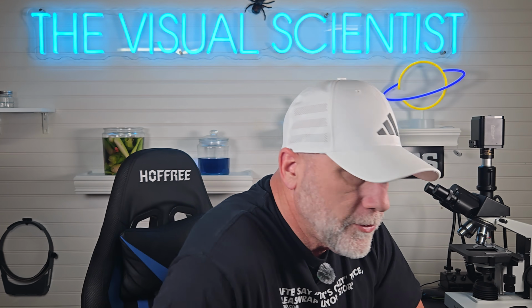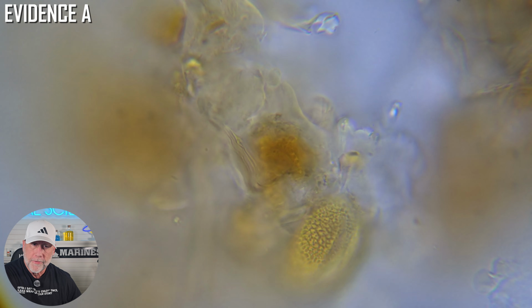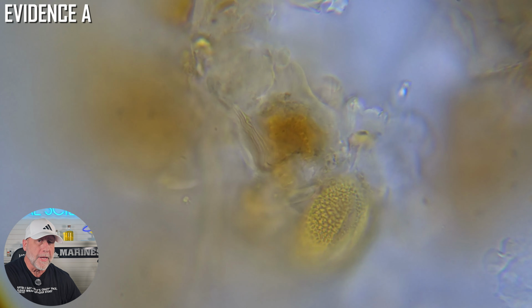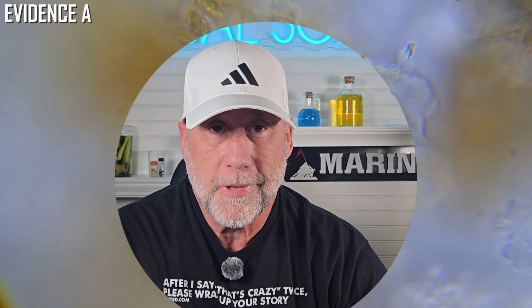Okay, now here's where it gets a little interesting. So look at the structure of this one, you guys. Look at the geometry. It's very consistent, very regular, almost like it was designed that way. Every pattern almost identical to the one next to it. I'm going to keep moving across the slide. Let's get to the kill shot. 1,000 times. Oil immersion. Let's go.